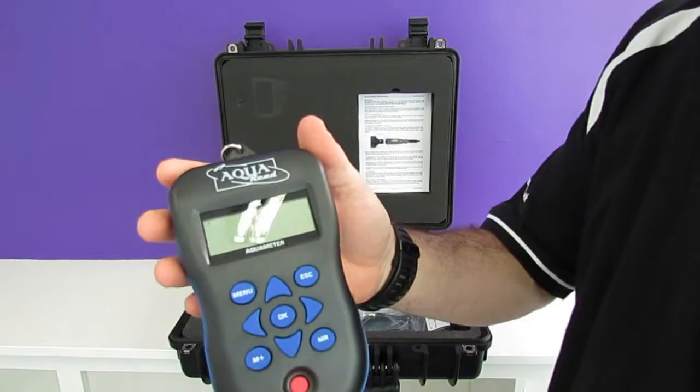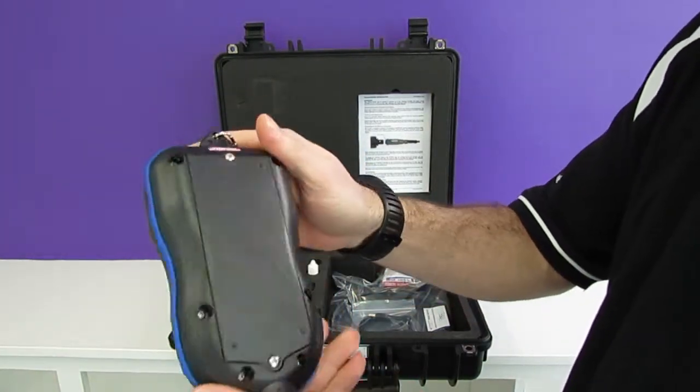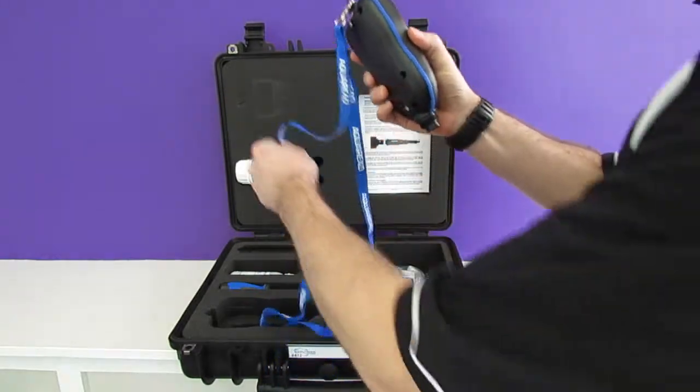First off we have the GPS aquameter to show you all of your live data and also to record your data, complete with lanyard.